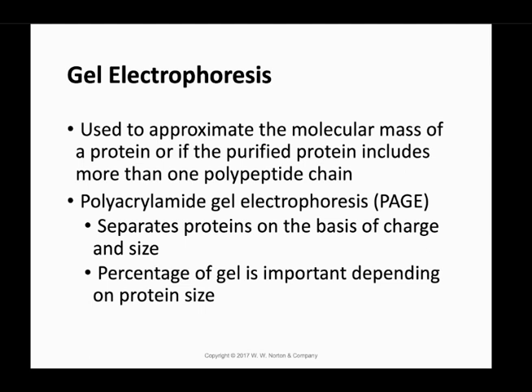And it separates the proteins based on the size and the charge, okay? And it's important, you can use different percentages of the polyacrylamide, and that will make a difference on the size, right? And the pore. So if you have a very high molecular weight of proteins, let's say 400 kilodaltons of protein, which is pretty high, you will need a low percentage of the polyacrylamide gel.